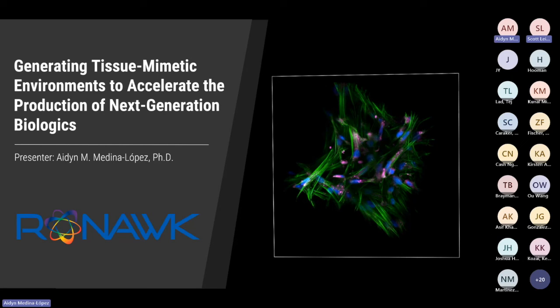Next question is regarding drug-resistant experiments. An increase in GI50 is generally associated with de novo mutations. Were the cells sequenced to identify any underlying mutations? Also, have you tested if cells grown in bioblocks are genetically more stable than traditional 2D? Oh, that's an excellent question.